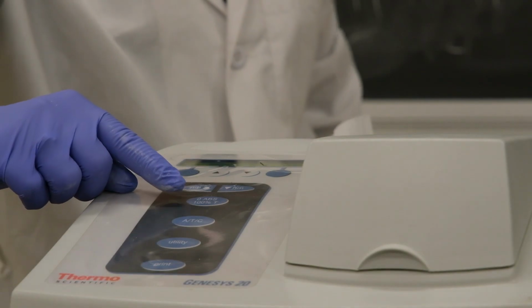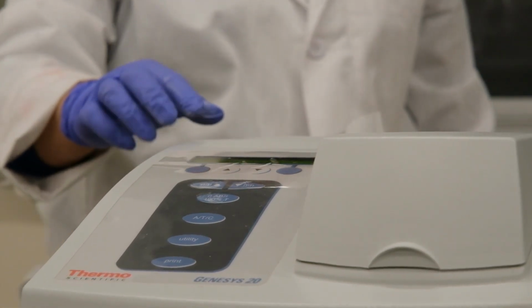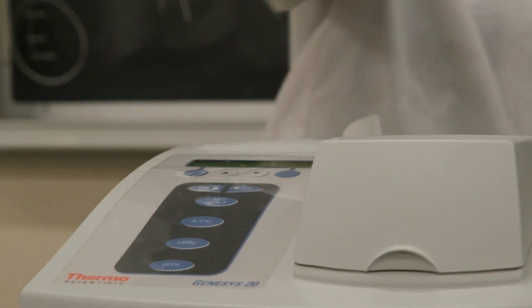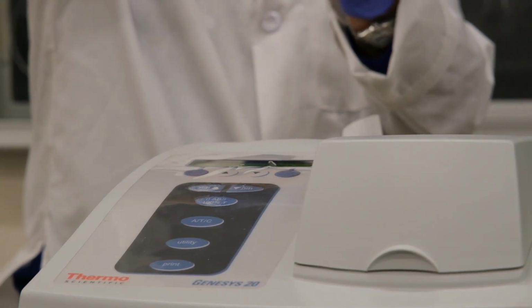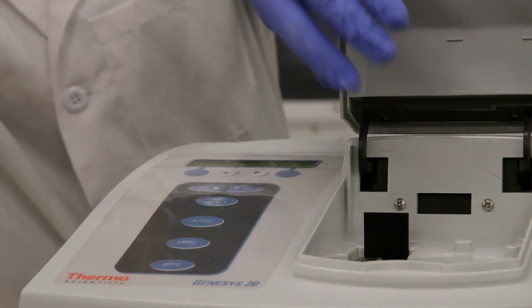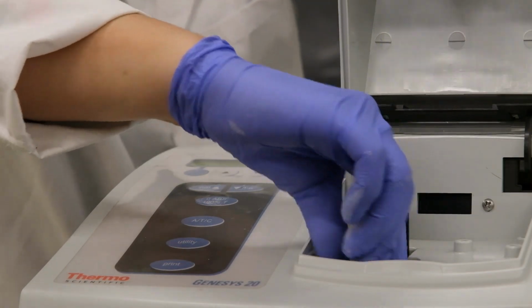We calibrate the instrumentation with the blank. When the blank is reading 0, then we put in our solution of brilliant blue. And we start to collect our data, okay?